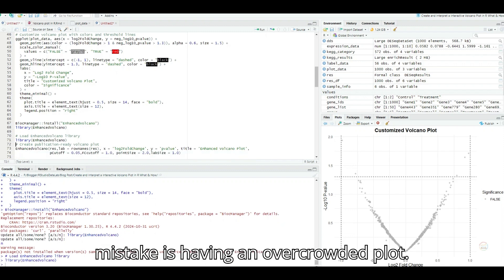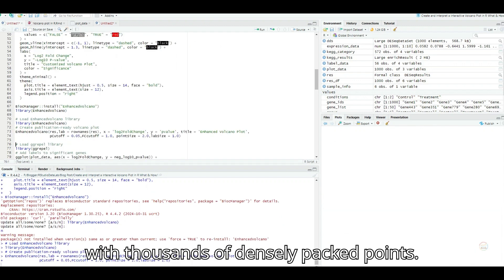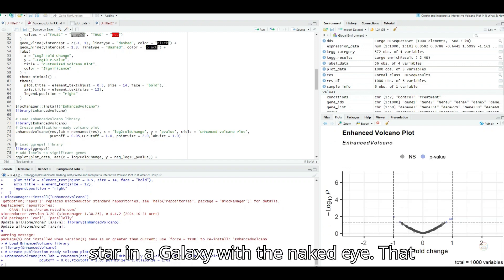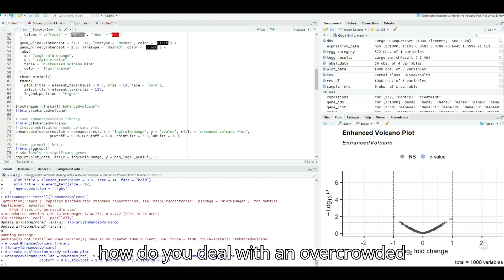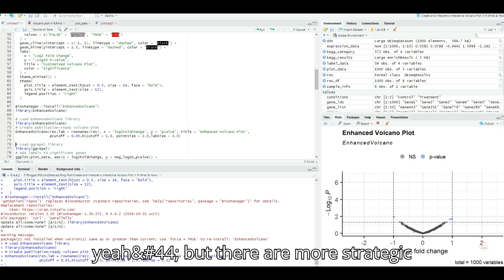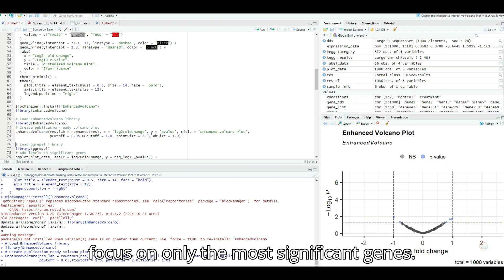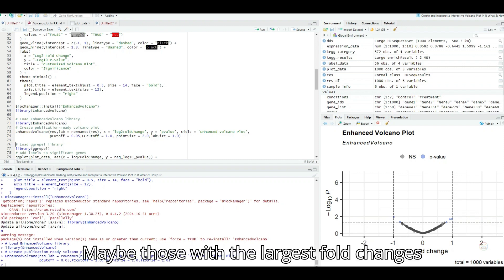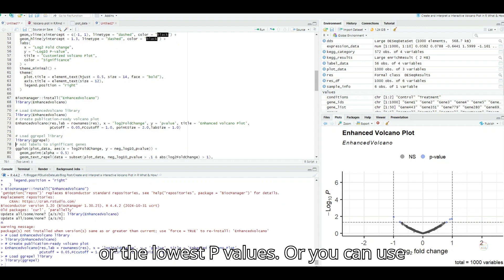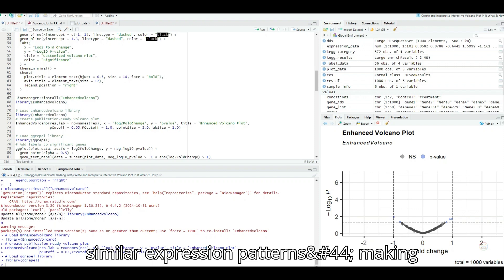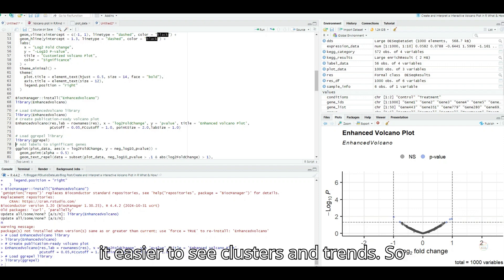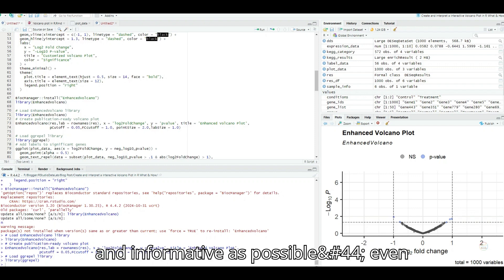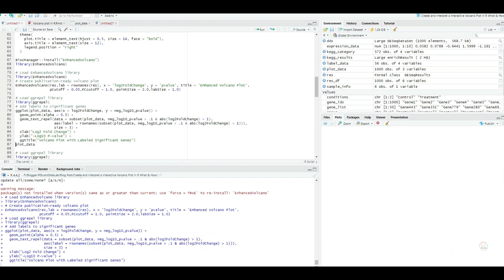So it's like setting your spam filter to be super aggressive and accidentally filtering out important emails? Exactly. On the other hand, setting the threshold too low could lead to a flood of false positives, making it hard to separate real signals from random noise. So finding that sweet spot is crucial for getting meaningful results. Absolutely. Another common mistake is having an overcrowded plot. Imagine trying to decipher a volcano plot with thousands of densely packed points. It'd be like trying to find a specific star in a galaxy with the naked eye. That sounds like my email inbox some days. So how do you deal with an overcrowded volcano plot? Do you just need a bigger screen? Sometimes it feels that way. But there are more strategic approaches. You can filter the data to focus on only the most significant genes, maybe those with the largest fold changes or the lowest p-values. Or you can use color coding to visually group genes with similar expression patterns, making it easier to see clusters and trends.